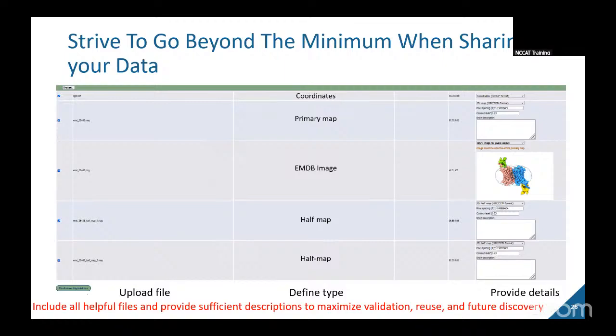And usually, I think part of the issue is that every time you reload this page, if you had to load it a couple of times, it wipes whatever you typed in. Well, the DepUI is not reflecting the most up-to-date annotation, what's in the model file. So it is buggy, and this is something that we are trying to improve. You have to be careful looking at the DepUI and trying to make sense of it after we send the processed files, because there are times it would just stop updating things, but if it does come through, it should. I always check this at least. Sometimes we do have instances where the EM map category just kind of goes crazy.